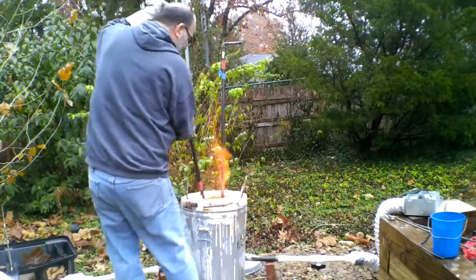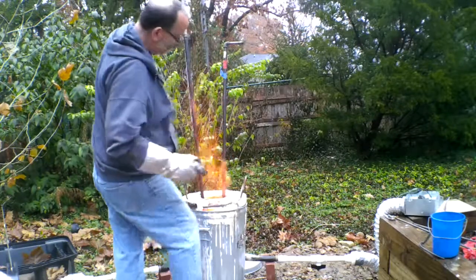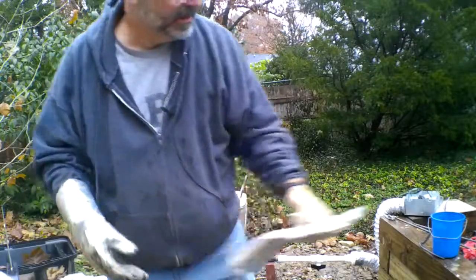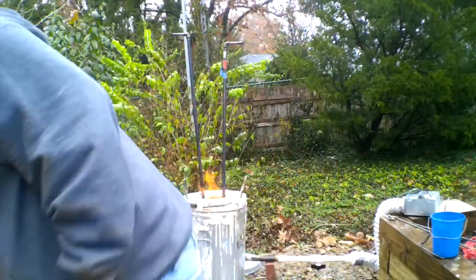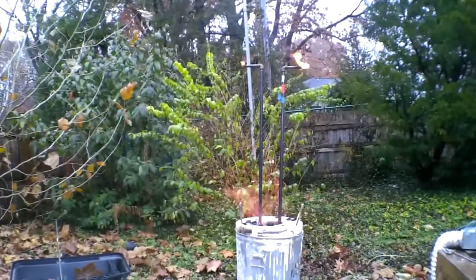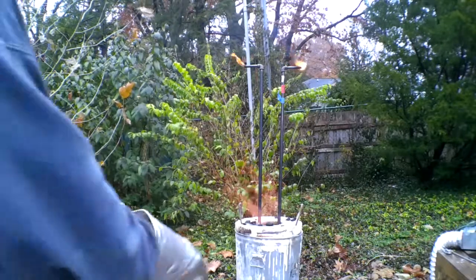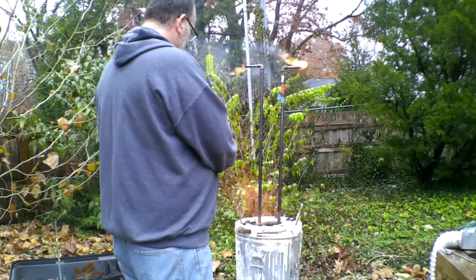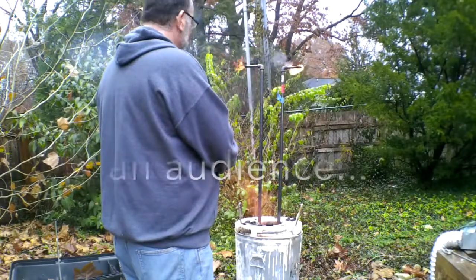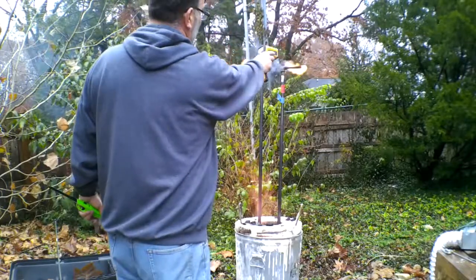We'll go ahead and put these retorts in here and let them get nice and hot. We'll let them gasify a bit, and we'll see what we get. It doesn't take very long to get these things to start outgassing. It's been less than 5 minutes. We'll just keep going until they stop making gas. See, that's 400. That's 520. That is a burp, and you can already see the little sparks, right?